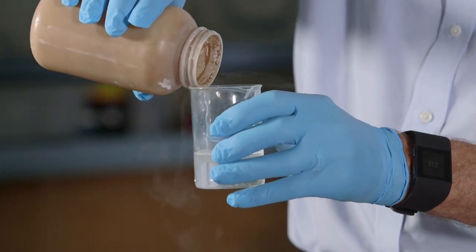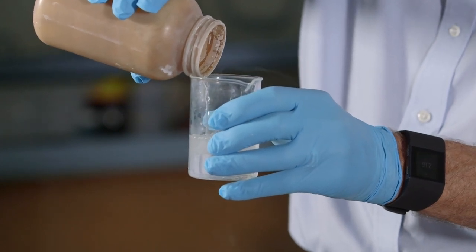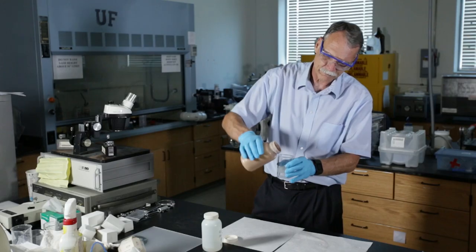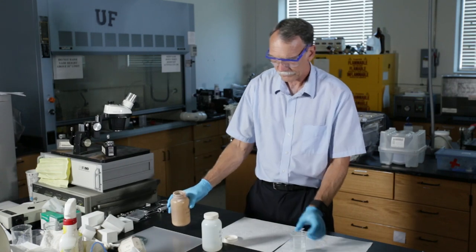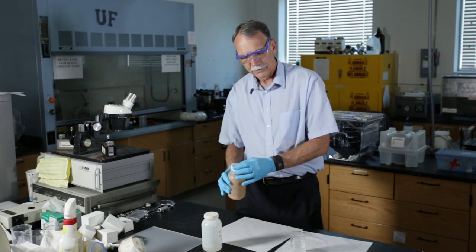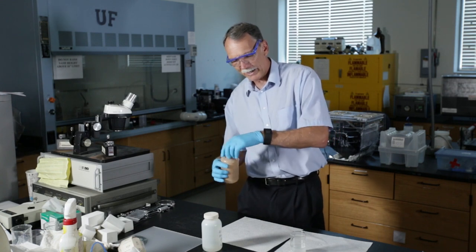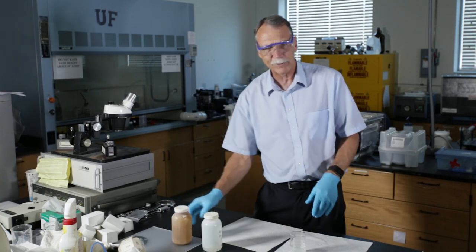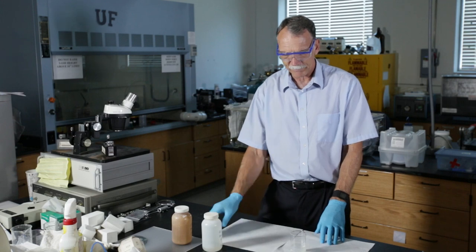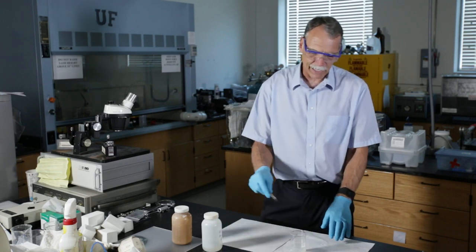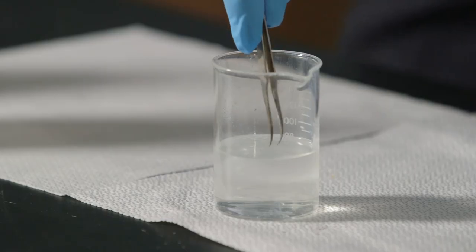What you're going to see is that now this material is sitting on top, and what happens is what we call an interfacial polymerization. Again, big word. What it means is that at the interface I am forming nylon.